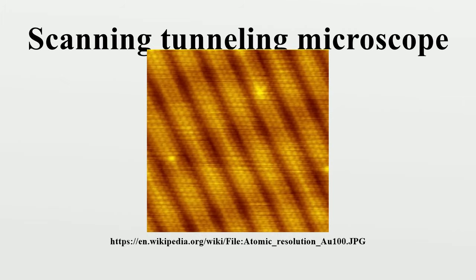Therefore, it has been essential to develop processes for consistently obtaining sharp, usable tips. Recently, carbon nanotubes have been used in this instance. The tip is often made of tungsten or platinum iridium, though gold is also used. Tungsten tips are usually made by electrochemical etching, and platinum iridium tips by mechanical shearing.